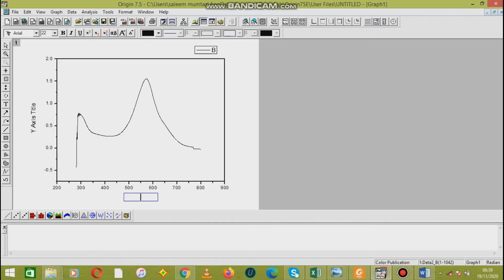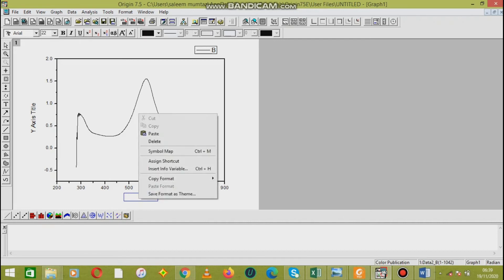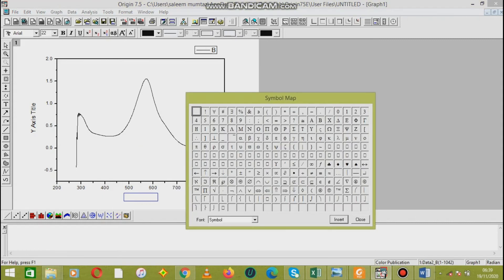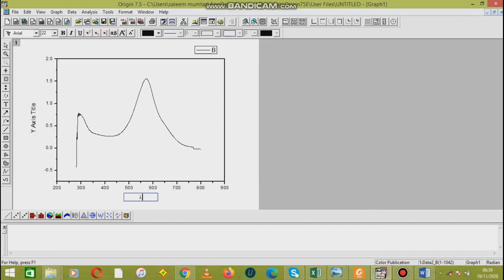Here we also take lambda as the label for the x-axis. The unit of the wavelength is also added here.